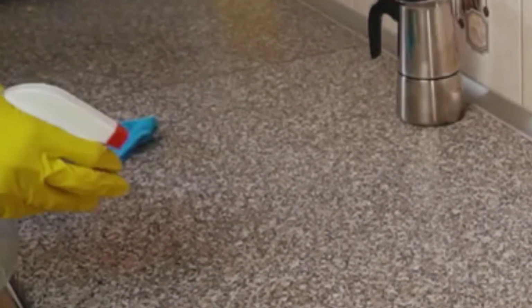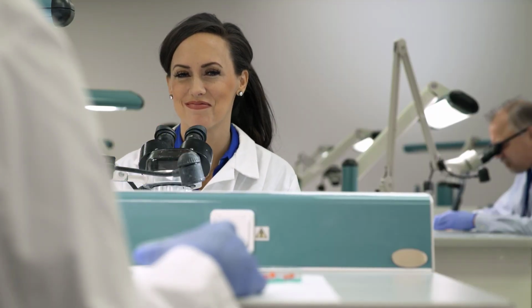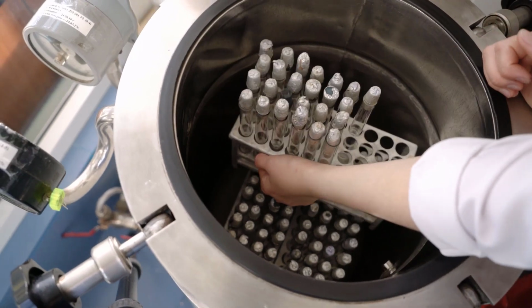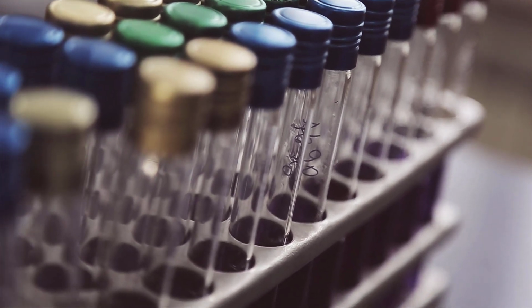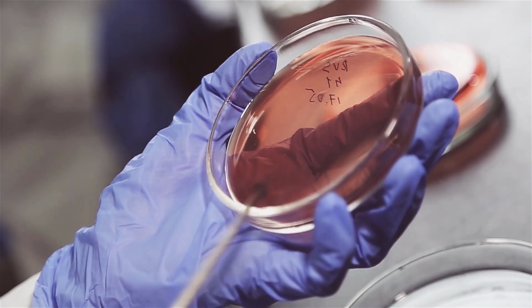Hands and bench tops are kept clean with disinfectants. Laboratory coats are worn, long hair is tied back, and working areas are kept clear of all unnecessary items. Containers used for specimen collection or culture material are pre-sterilized and capped to prevent entry by unsterile air. Sterile tools are used for transferring specimens or cultures.